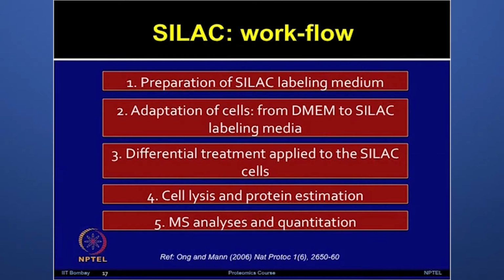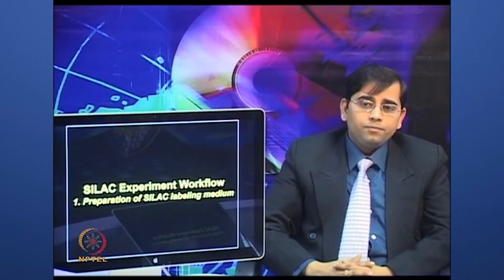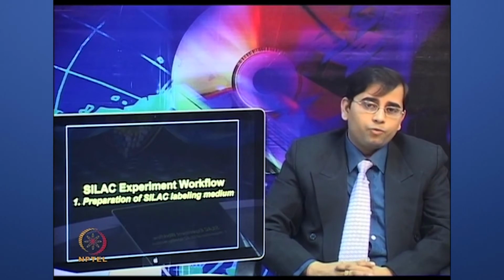First step is preparation of SILAC labeling medium. Second, adaptation of cells from the normal DMEM medium to SILAC labeling media. Third, the differential treatment application to the SILAC cells. Fourth, cell lysis and protein estimation. Fifth, MS analysis and quantification. So, let us look at the workflow stepwise.